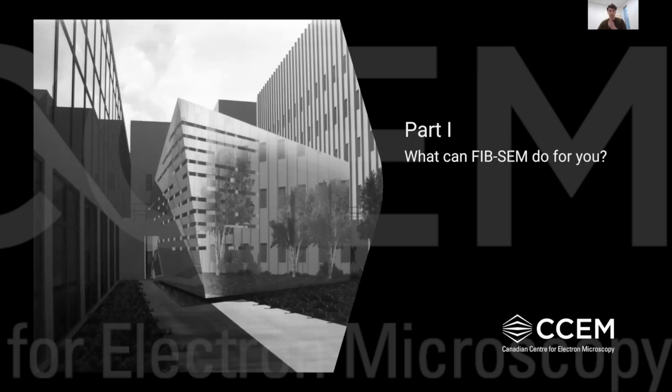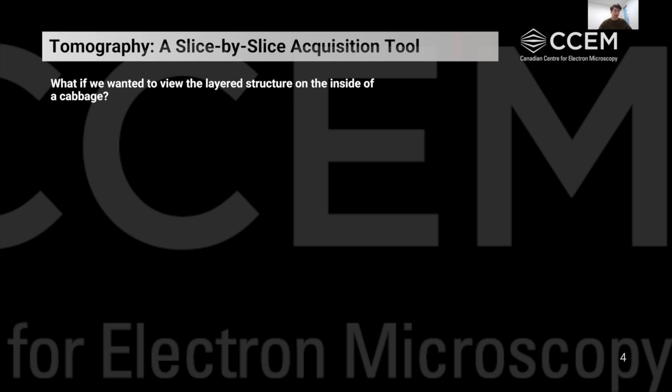So part one, what can FIB-SEM do for you? And with this, I actually don't want to start in the microscope. I want to start in the kitchen.